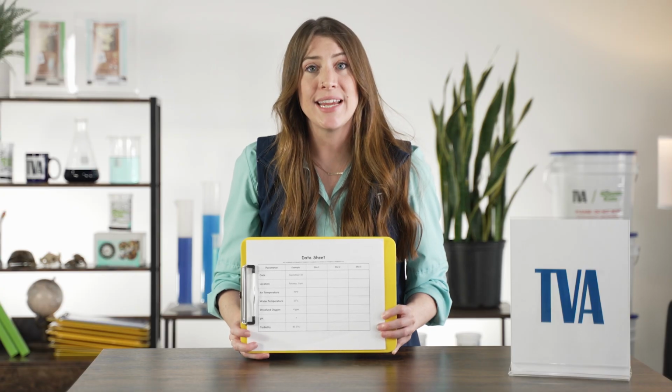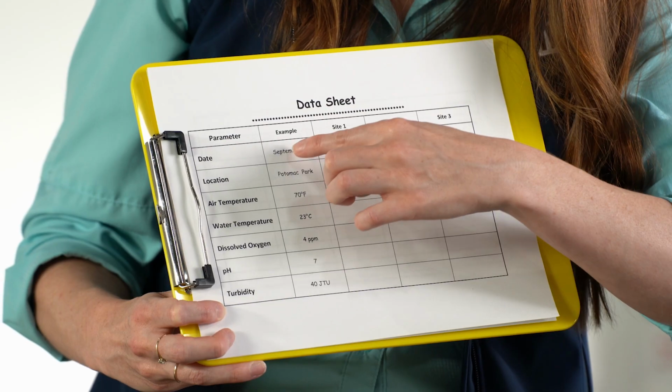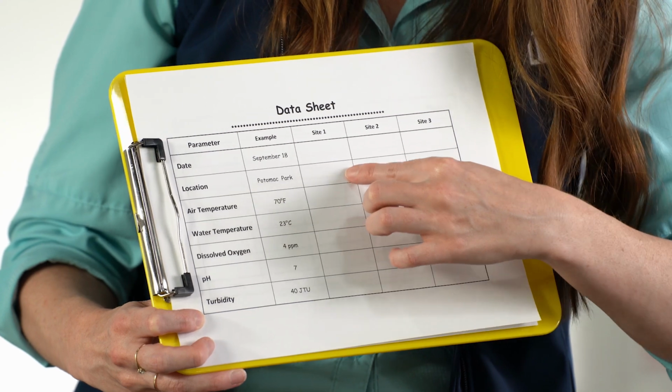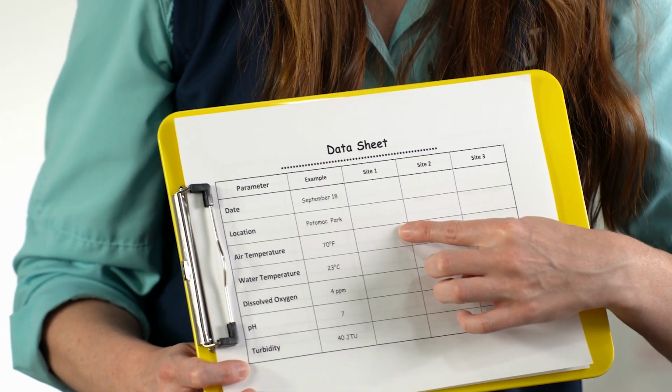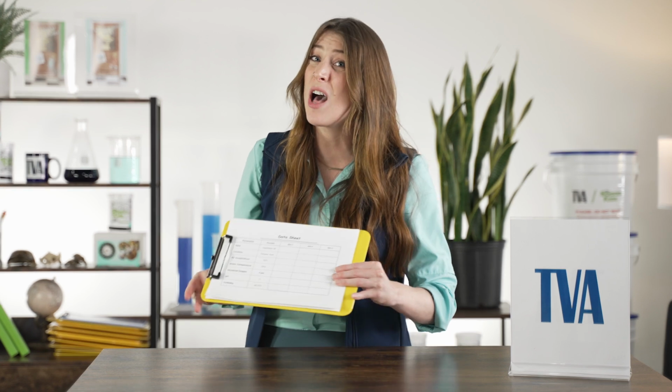So on your data sheet, under Site 1, because this is the first time that you are testing this water source, you are going to fill out the date, the location of where you got your water, and the current air temperature. It's important for scientists to check their equipment as well before they go out in the field or start an experiment. Can you imagine if you got on a boat all the way in the middle of the river and realized you'd forgotten something? That's a huge waste of your time. So we're going to check our equipment and make sure that we have everything and that it works correctly.